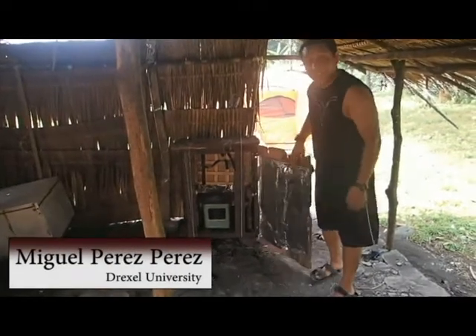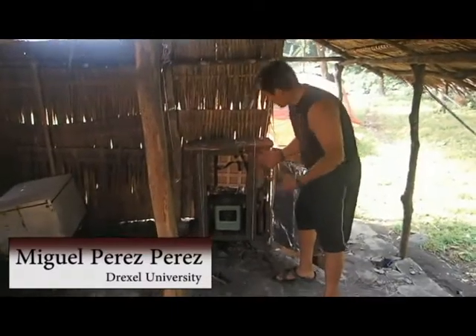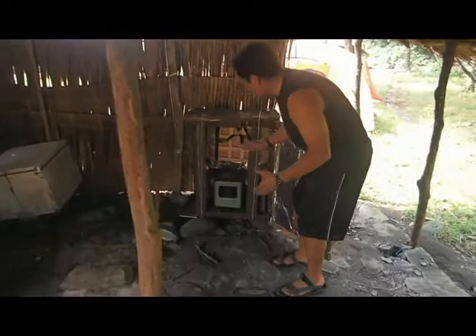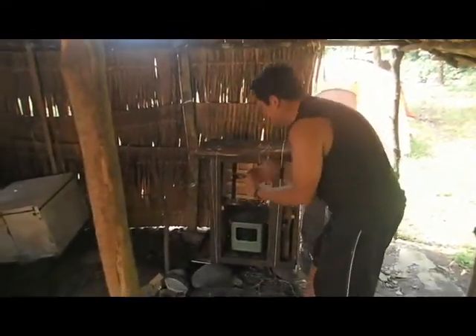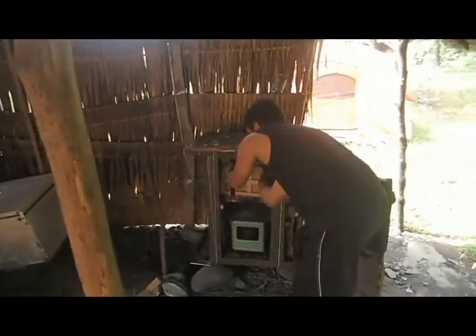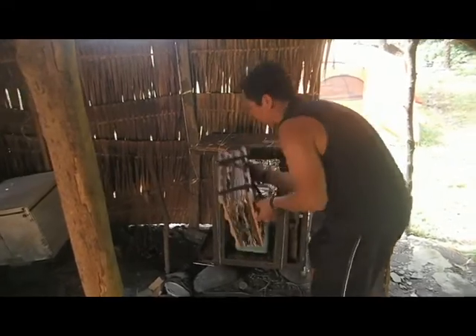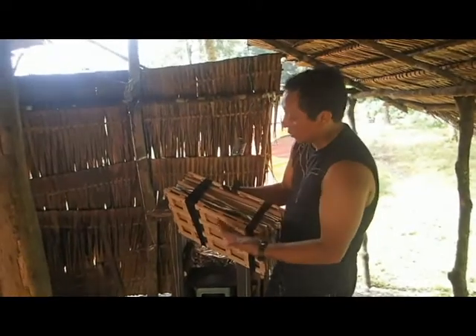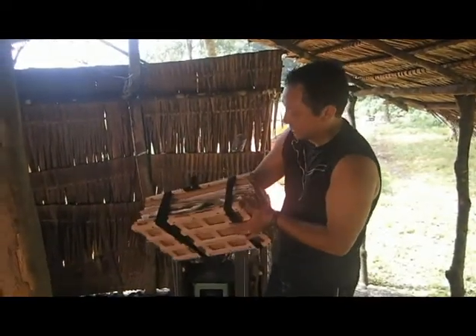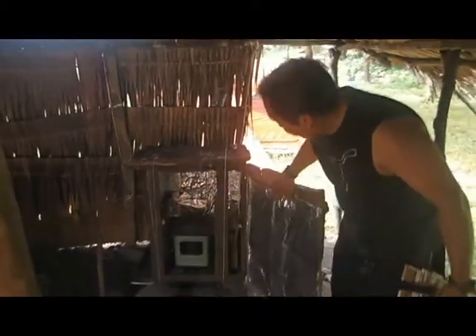This one is a plant dryer. When we are in the forest, it's very important to have our plants dry, otherwise the plants are going to be in bad shape. All the work that we put into collecting plants would be wasted because the plants are going to be wet and it's going to be hard for transport and for research. But right now here we have a plant dryer that we built.